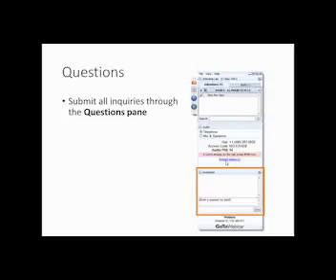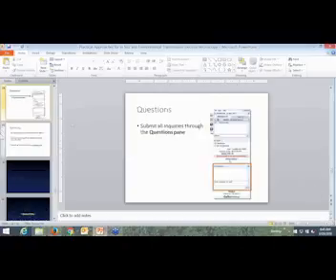The first one, Eileen, is could you please suggest best approaches to test and prevent beam damage, like oxidation and reduction? Best approaches to test and prevent beam damage. Okay, so the example which I had shown to test beam damage was, let me pull back to one of the earlier slides.